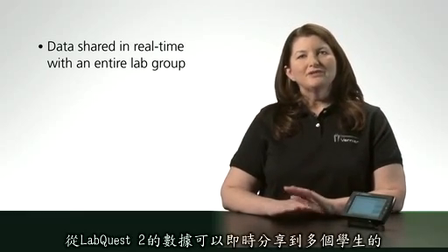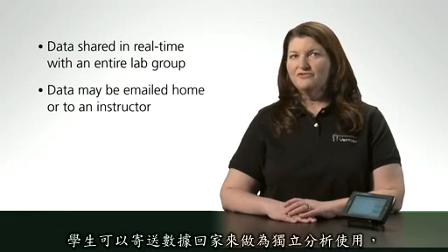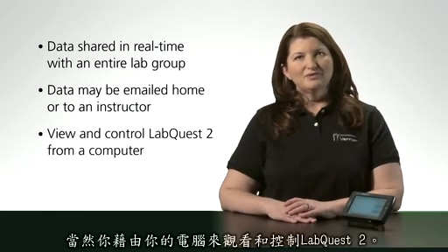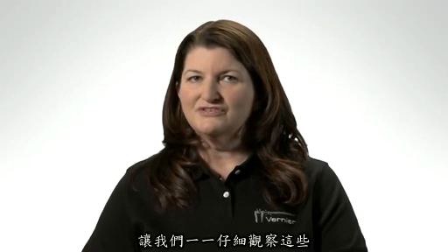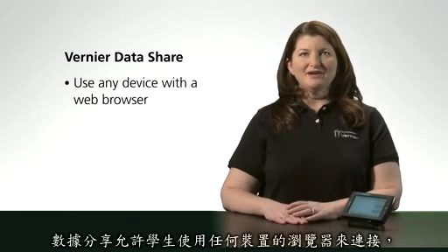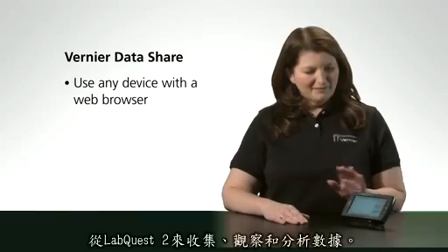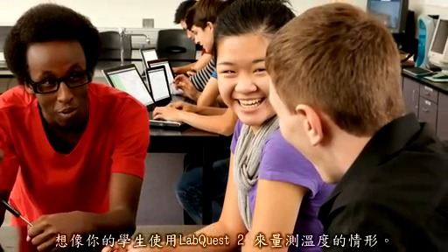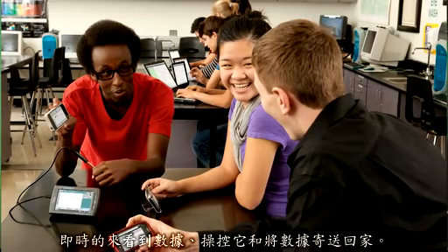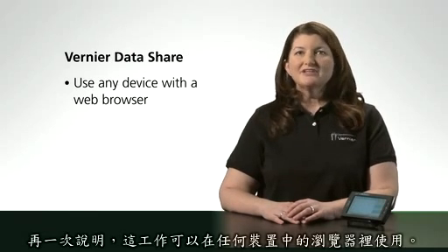Here are some examples. Data from LabQuest 2 can be shared in real time among multiple students in a lab group on iPads and other mobile devices. Students can send their data home for independent analysis or submit the data directly to the instructor. You can also view and control LabQuest 2 right from your own computer. Let's take a look at each of these new features in more detail. We'll start with Vernier DataShare. DataShare allows students to use any device with a web browser — such as an iPad, iPod Touch, or Android device — to collect, view, and analyze data coming from a LabQuest 2. Every student ends up with their own copy of the data for independent analysis, and this works on any device with a web browser.